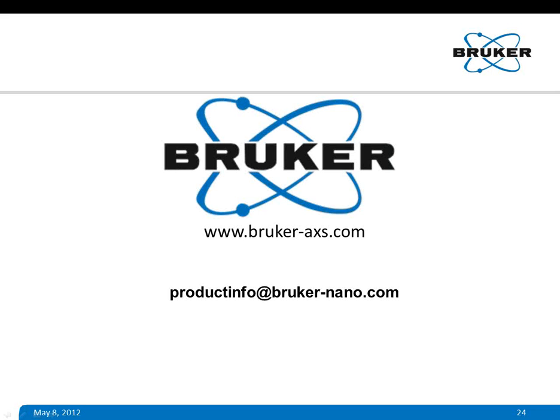Following on from that, can you differentiate between mechanical and tribocorrosion dictated wear volumes? Yes, you can differentiate because, as I explained in the presentation, you need to do several experiments. For instance, you perform a test with tribo on and chemical on, and you get the total wear volume, that's T, and then you perform 3 more tests. One is with suppression of the corrosion media by applying a cathodic potential of around 1 volt with respect to the E-corr, and then you find one parameter, which is CW in this case, and you do the other 2 experiments. All these 4 experiments are needed to differentiate between wear due to only mechanical action or wear due to mechanical plus chemical action.